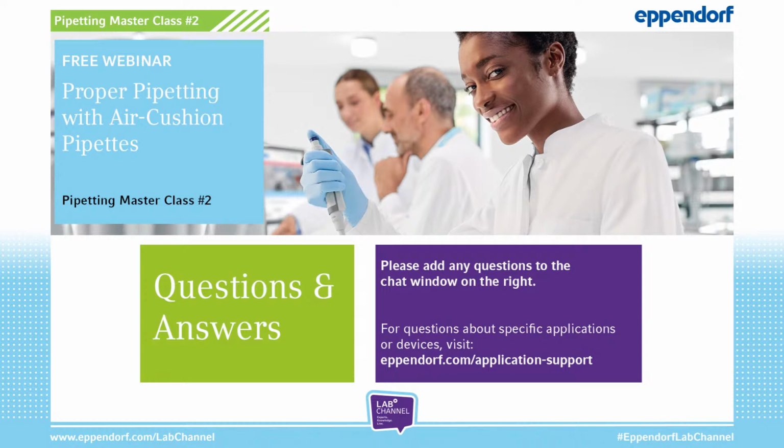When you think about the chemical resistance of pipettes and tips, and here I refer to the Eppendorf products, air cushion pipettes can also be used for many difficult liquids, which differ from water. And so here it's important to check the chemical resistance lists for the devices.